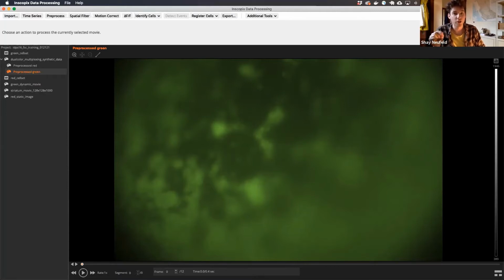So we have to go back now and rethink how to do the pre-processing API function and make sure we can add in that functionality while being backwards compatible, so it doesn't break everybody's API functions when we add in the deinterleaving. So everything else here should be pretty consistent across the API and the GUI, but yes, this pre-processing deinterleaving thing has been awkward since the multiplane days, and we haven't fixed that yet, so it's still a bit awkward in these multiplex.